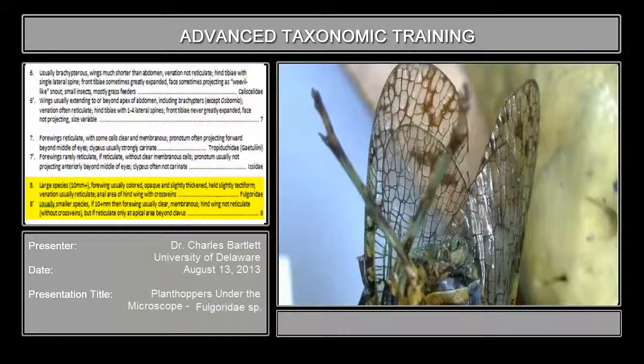So that is what I had for family-level keying. It's enough that you've seen almost all the families. We'll have to move on in just a moment to looking at genera of bilf acids.